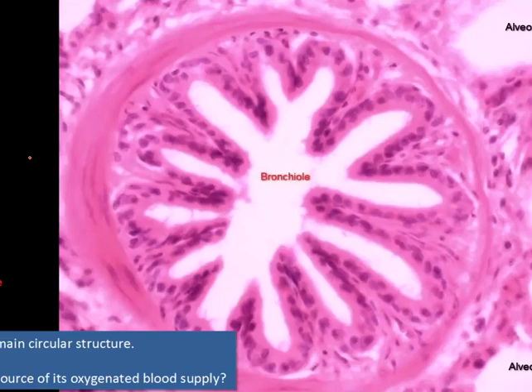It is a bronchiole. Bronchioles measure 1 millimeter or less in diameter, and the epithelium gradually transforms into a simple ciliated columnar epithelium like the one that we see in here. Goblet cells might be seen in the largest bronchioles, but they are not present in the small terminal bronchioles. I can hardly see a goblet cell in this section. In people who are exposed to irritants in the air, there will be excess of goblet cells, as we have mentioned for other parts of the conducting respiratory passages.